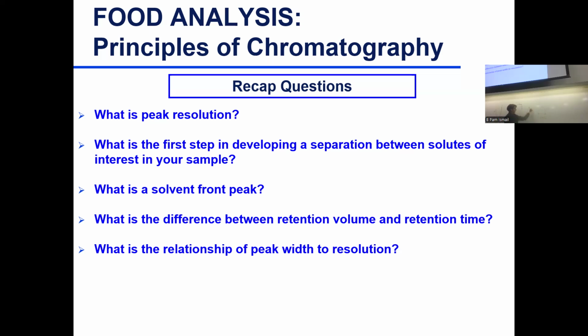If you had another peak here, then you see this coelution happening and you lose resolution. Because now, instead of having two sharp peaks, they widen, they diffused inside of the column more than move with the mobile phase. And that diffusion made them spread and come out over an extended period of time.